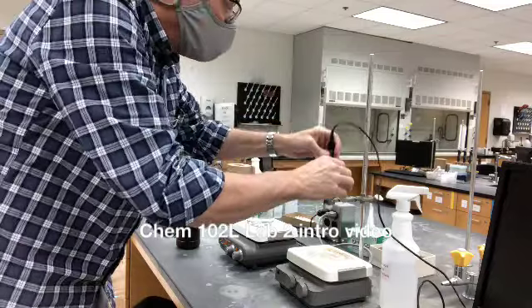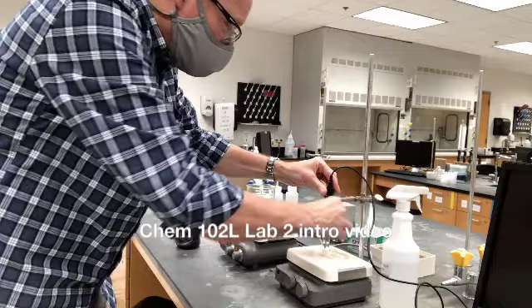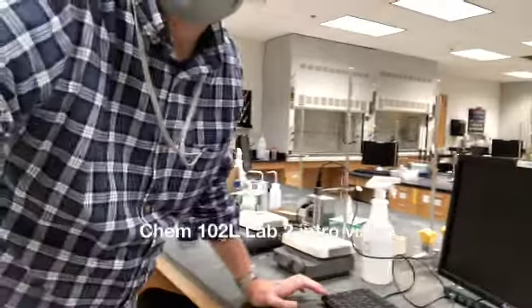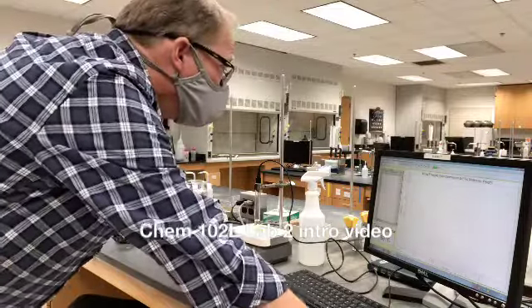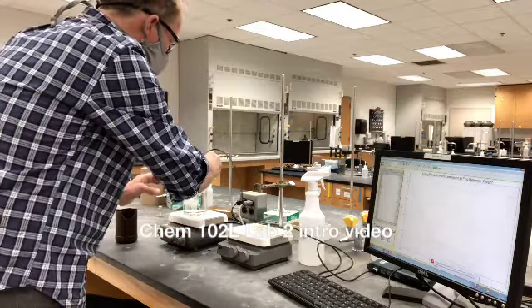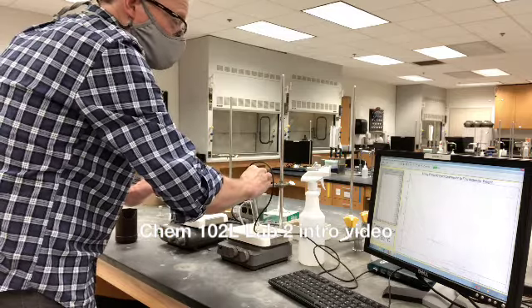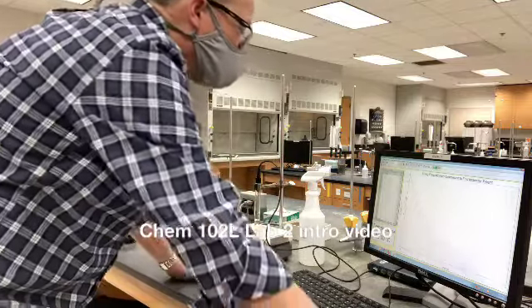And when I place that over the stir plate, it's now stirring, and I have Logger Pro running here, and the temperature is a little bit below 50. I want that temperature to be above 50, so I'm going to warm it a little bit, and let's see if we get above 50. We are above 50, and I'm going to start collecting.